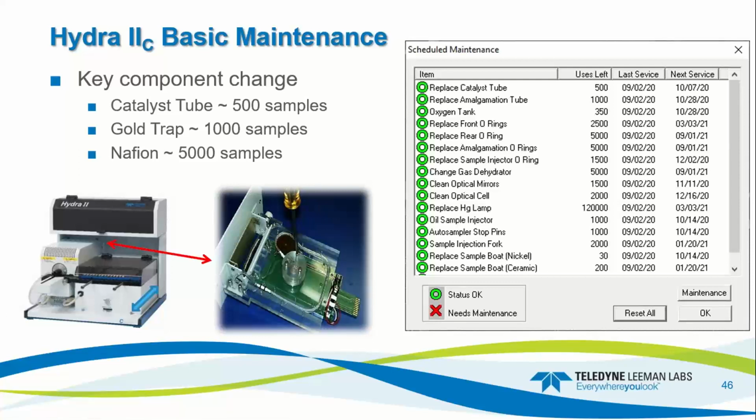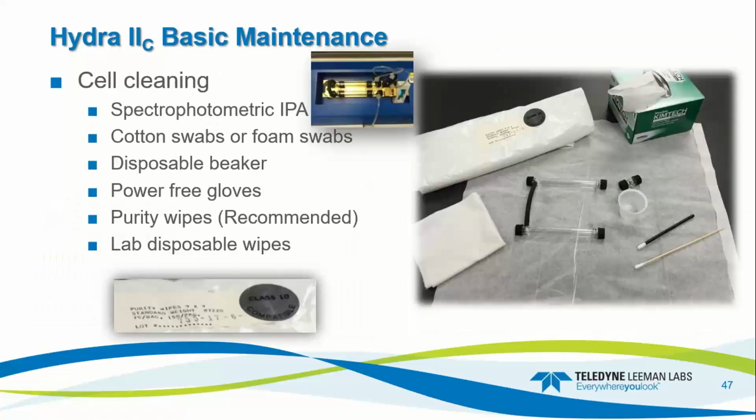For the non-experienced, for the experienced person, maybe 15 minutes to change the Nafion. Just a couple of minutes to change the gold trap, and you're on the way.